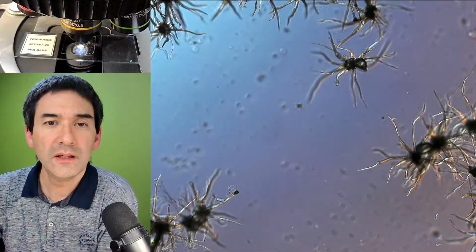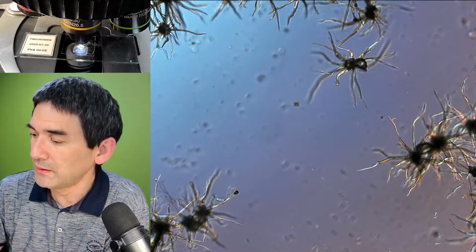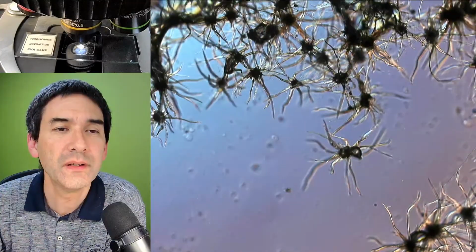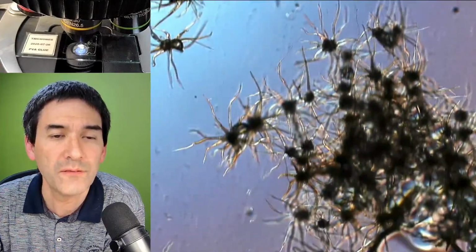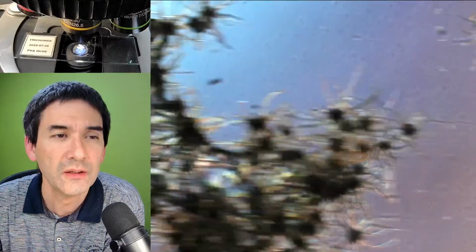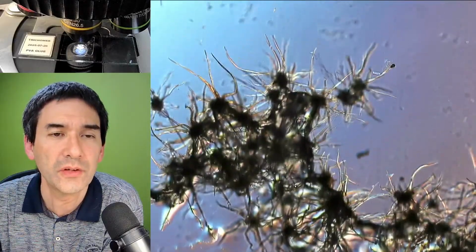So, and here they are, okay? Sometimes you do find them in water samples even, and so these are basically those plant hairs. When I saw them several years ago for the first time, I said, what in the world are those? They look a little bit like spiders. I see. That's why they are clustered together over here, right?